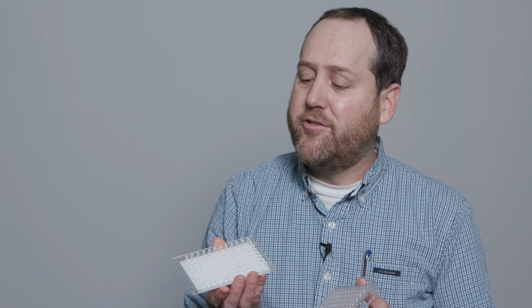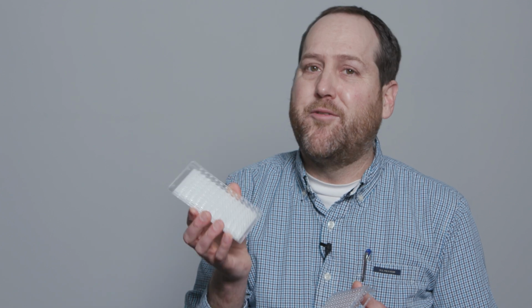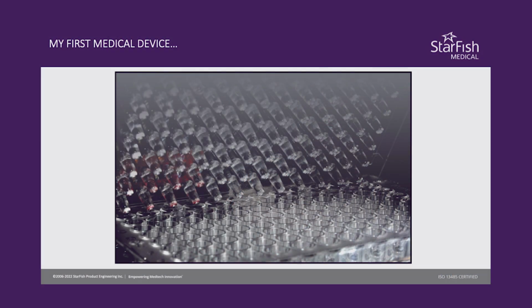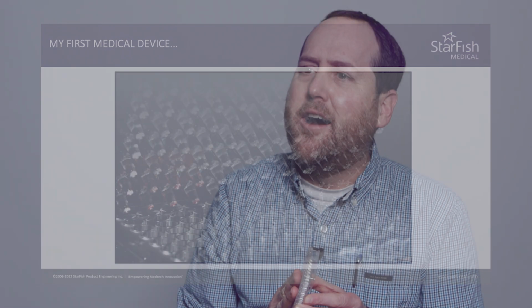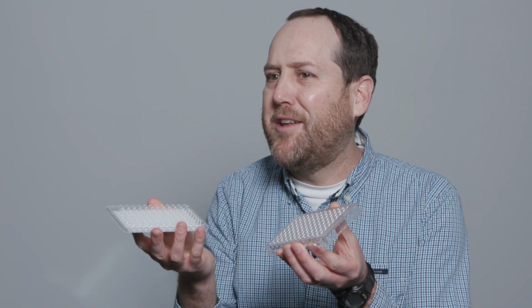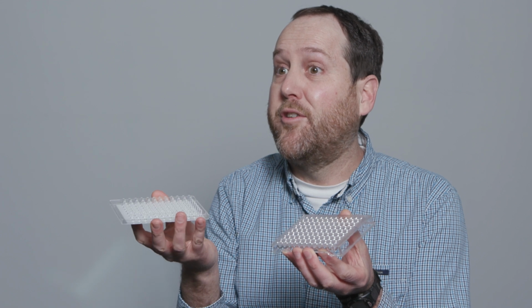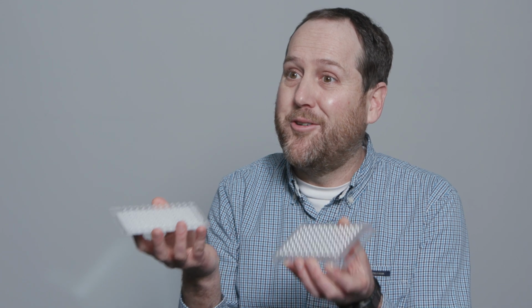And so early on in my career, I was working on a device. It's fairly simple by today's standards and the things that we do here at Starfish, but in fact, this is my first medical device that I developed. And what we would do is grow the biofilm on these little pegs here, expose them to different reagents, and see how well the device or how well the reagents performed. Now that's very interesting. From a development standpoint, we're just basically doing things in the lab, got some injection molders, made some parts, put these things together, and designed this product basically just to do research work. And that's fascinating when you're doing the research.